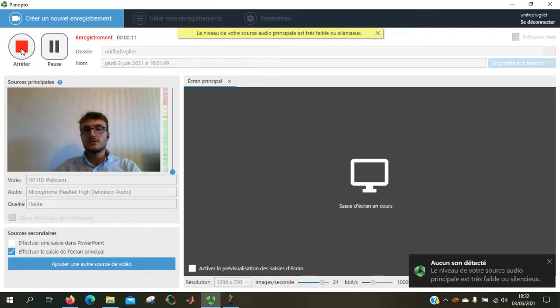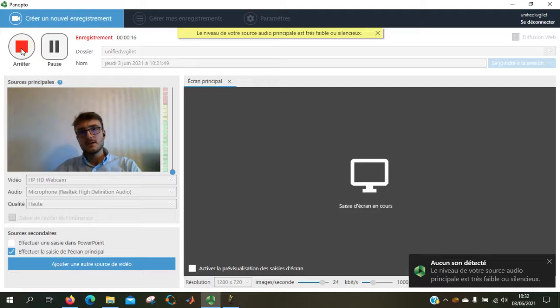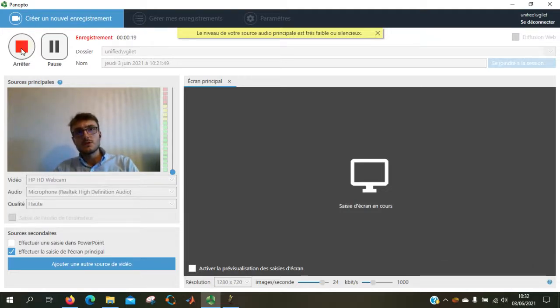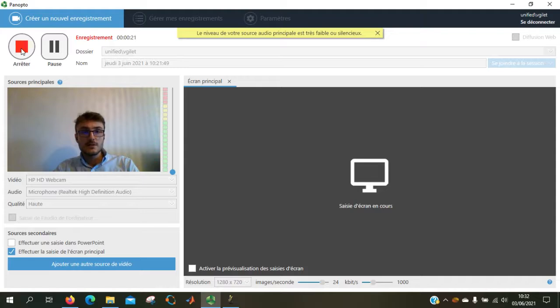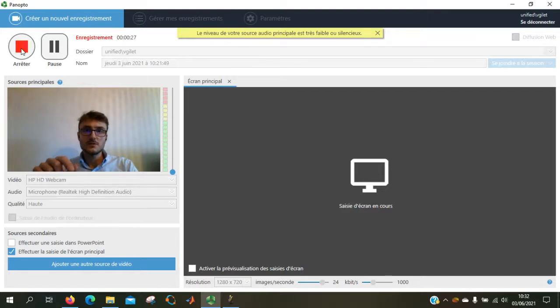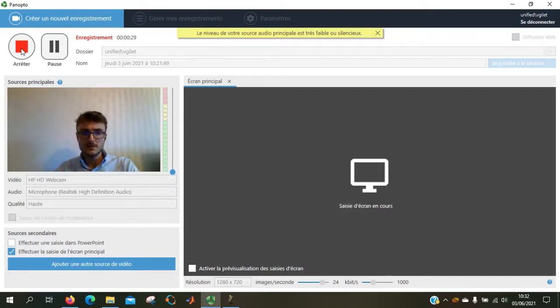So it's a script written in Python and it's based on the little shift of the seed. When the seed starts to germinate, it moves a little bit and the macro is here to detect this little shift.